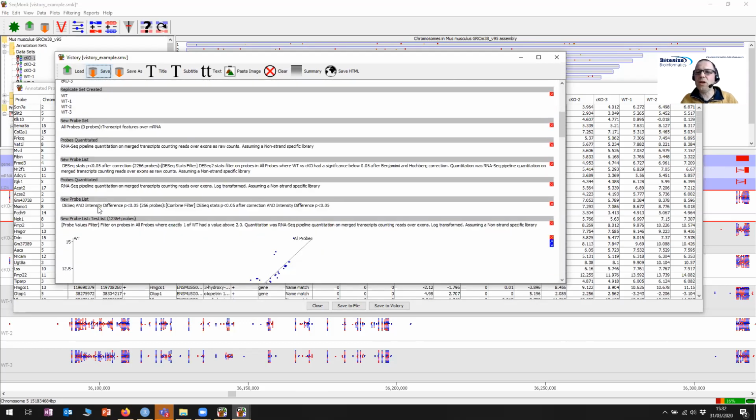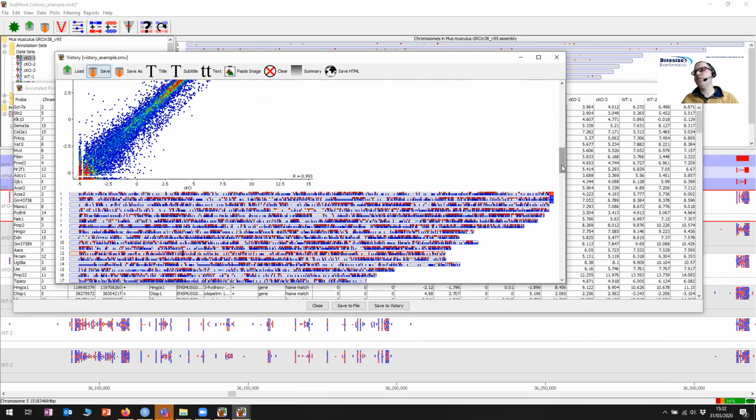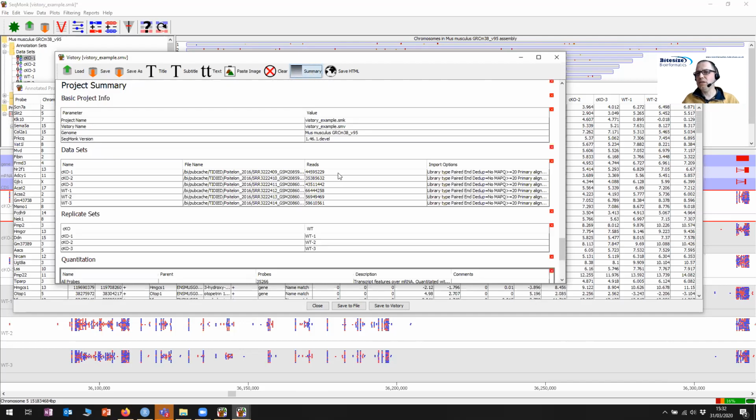So to make your life easier for that, what I often do is that instead of taking all of those individual events, we have another option in the Vistory here where we can insert a summary of the current state of the project. Okay, so if I look up on here, there's a button that says summary at the top. And having done all of that initial process, and I'm doing it at the end of this one, but normally you do it at the start, I can just press the summary button and it will insert a bunch of automatic events in here.